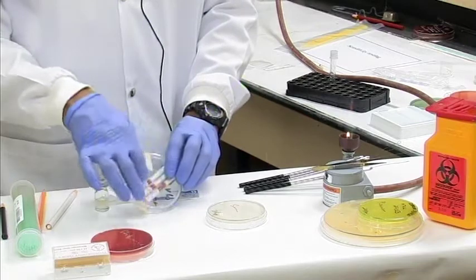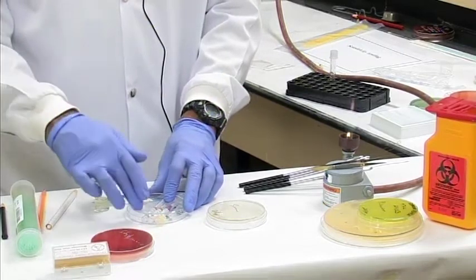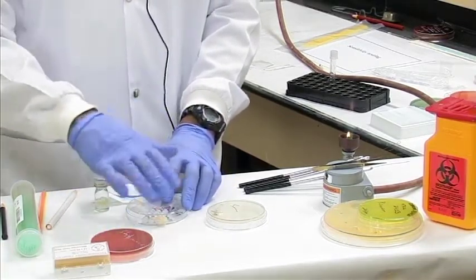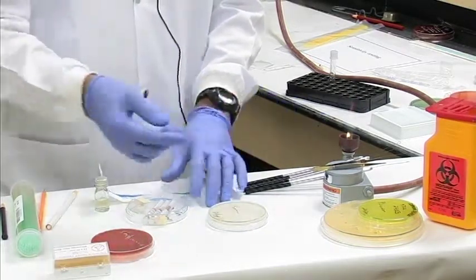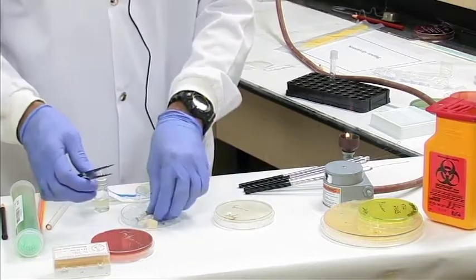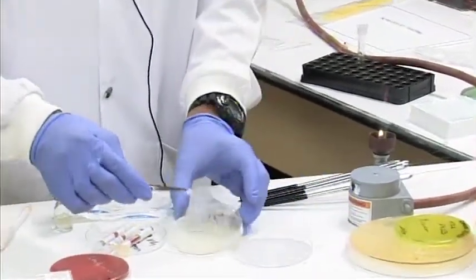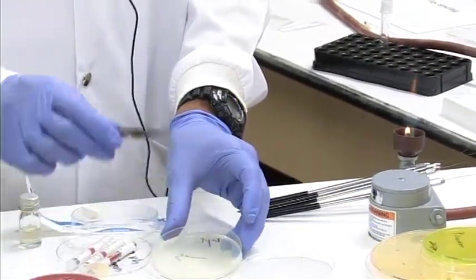You will choose your antibiotics. The amount depends on what pathogen you have, what is the expected result in terms of resistance and sensitivity. And that pattern of antibiotic disc will be placed on your plate. Now, there's some commercial systems where you can apply your antibiotic disc in a little dispenser and just press it and stamp it on. It will drop your antibiotics on your plate, or you can do it manually, as in this case. So let's assume 5 minutes would have passed. You're going to take your cooled flamed forceps and remove your antibiotic disc one by one and open the plate and apply it onto a spot, carefully without touching the forceps onto the surface of the plate. Just lightly touch it.